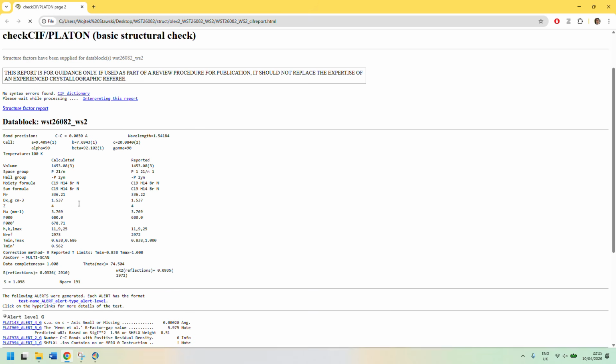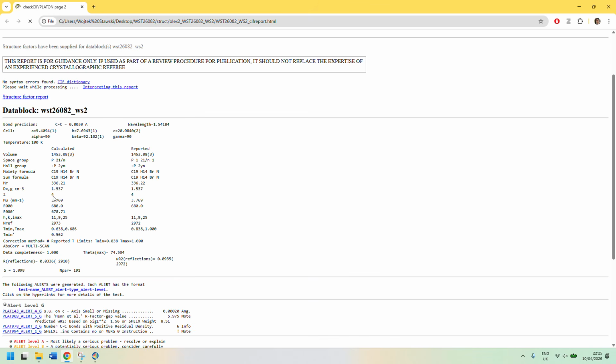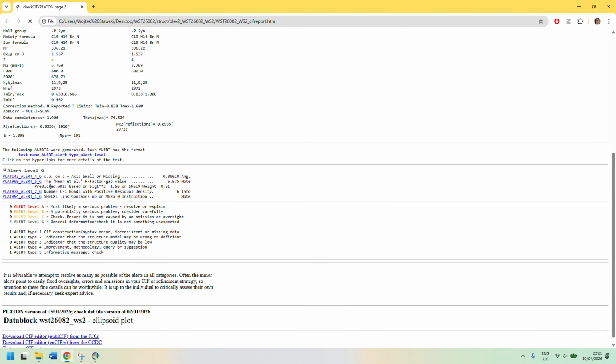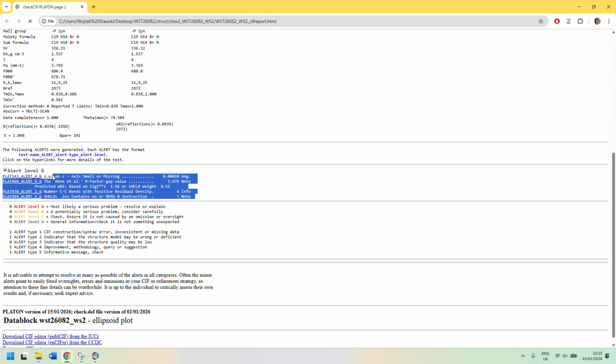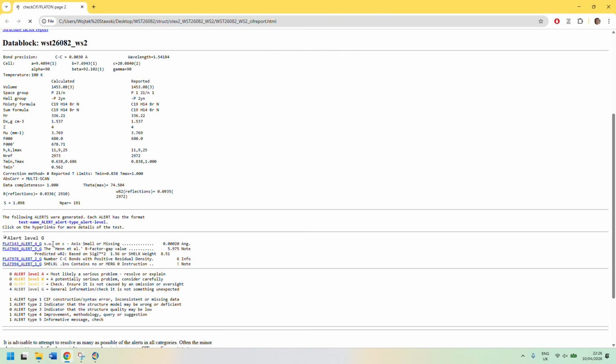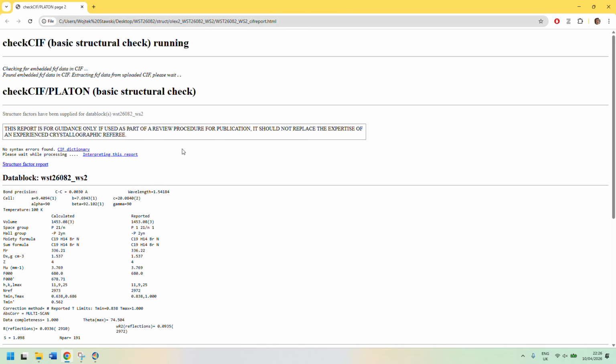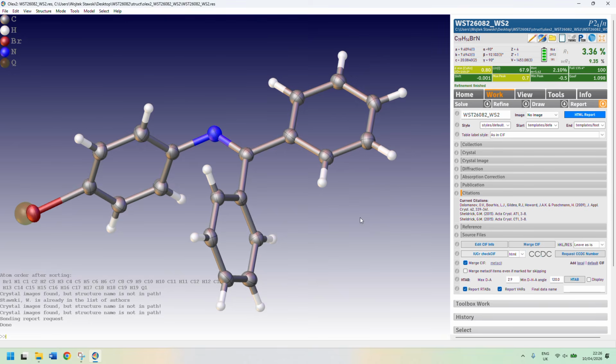Okay, so here everything's fine. I always have a look at the Z, whether the calculated and the reported one are really correct. Yeah, and here there are essentially no problems. Everything's perfect in our structure. No C-level errors, only G-level alerts that are more like information rather than something wrong. So we could basically publish the structure in the database now and be happy, which I already did.